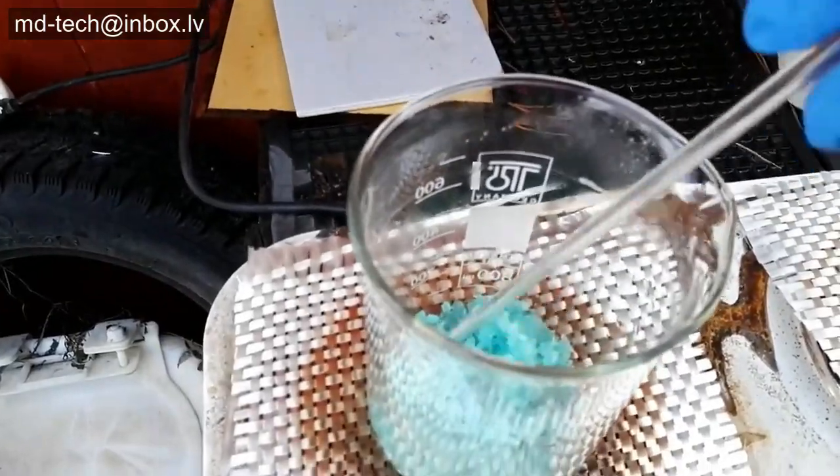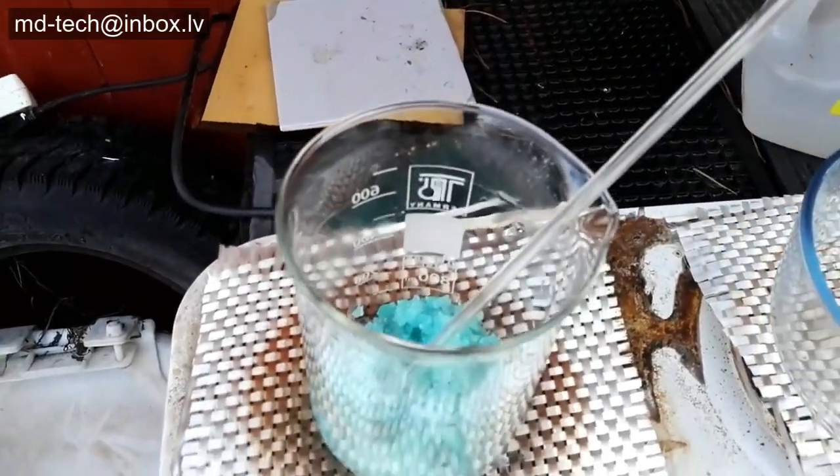After one hour, the iron is completely dissolved and has formed ferrous sulfate.